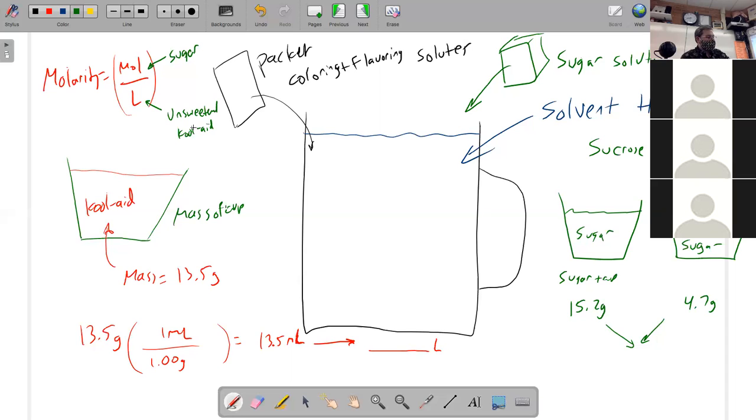All right. So anyway, the paper walks you through the steps, but in the end, your goal is to determine the concentration of your sugar in moles per liter, or in molarity, and then do the worksheet number 2 if you didn't finish that yet, and we'll go over that tomorrow. That sound good? All the materials are on the lab table.